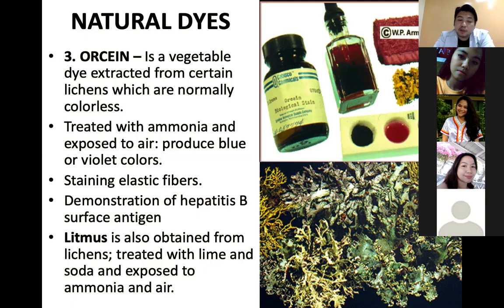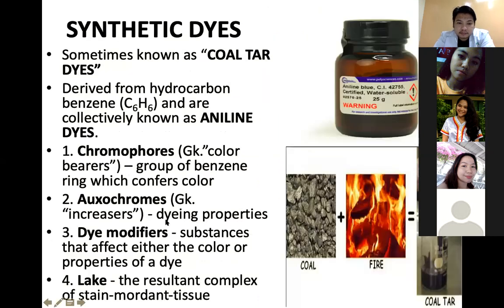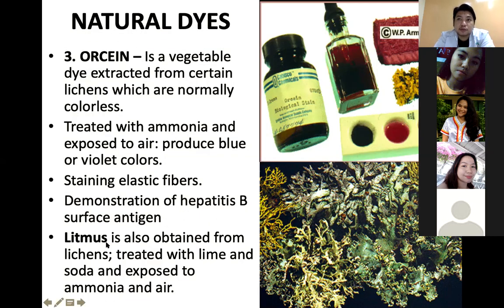We all know litmus for our pH testing, the litmus papers. So the stain used in our litmus is orcein.